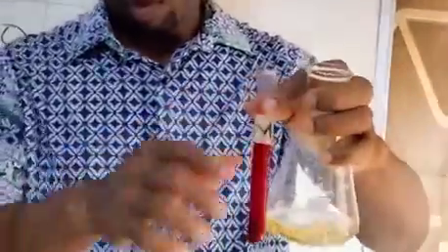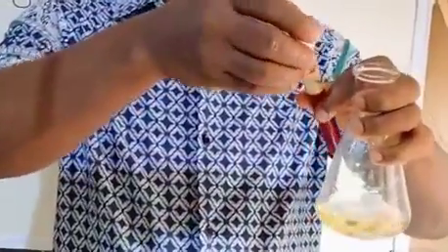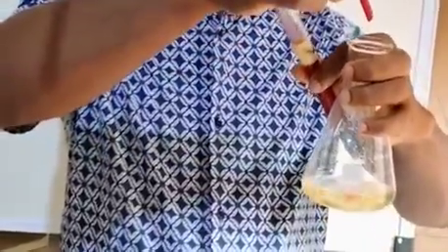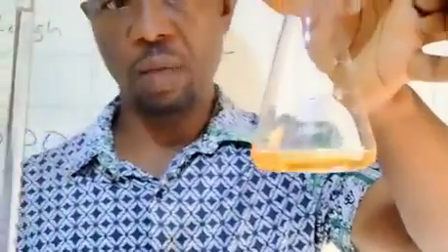If you're using 3 drops, use 3 drops all through the experiment. The color is faint, so I'm going to use 3 drops to make it more intense. So that is it. I can see the yellow color after adding 3 drops. So we'll now start our experiment.